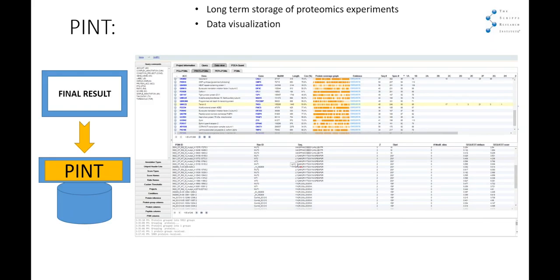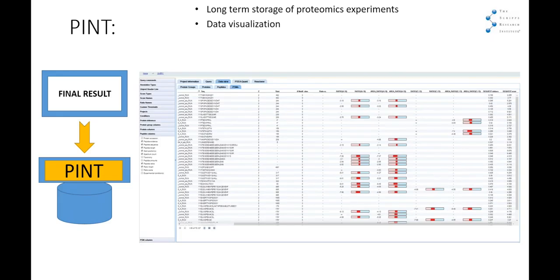The protein groups are grouped using an algorithm called P-Analyzer, which makes groups of proteins based on how they share peptides and classifies these groups into several categories like conclusive, ambiguous groups, non-conclusive, or indistinguishable. This is how we can visualize the PSM level with all the quantitative information - we can see several columns. At the left we can select which columns we want to include in the table and sort the tables. We can see all the ratios with some graphical representation. In this case these PSMs seem to be down-regulated because they are towards the left in red.